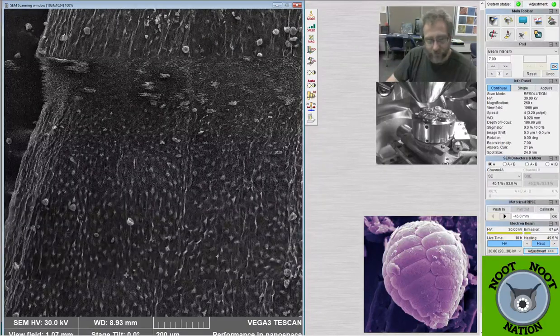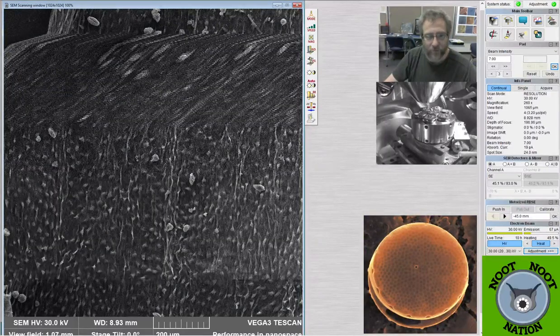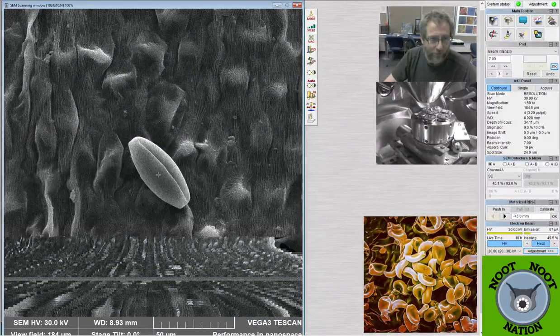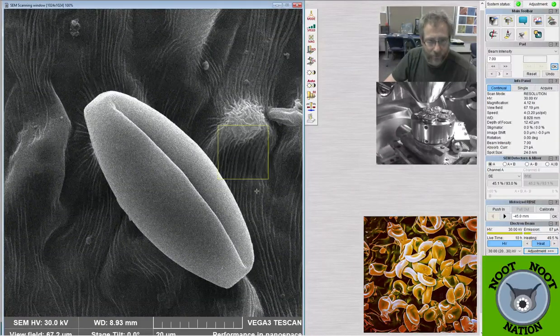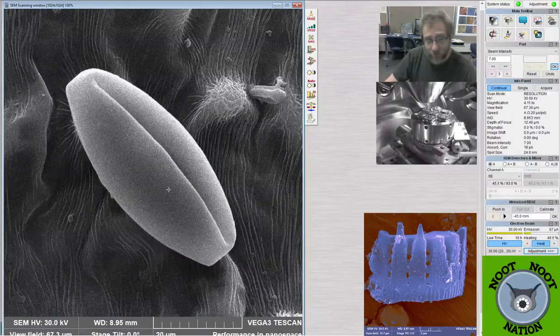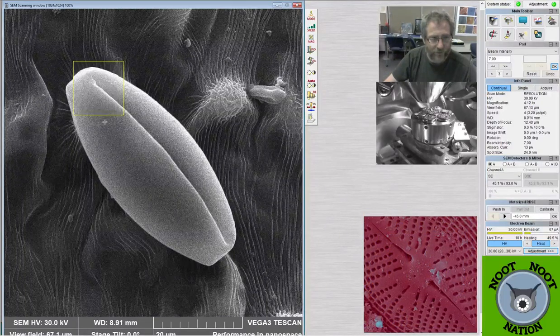There are sort of classes of microscopes that go from cheap and functional to the high-end stuff. But I would argue you don't need the high-end stuff. Very rarely would you need something like that for something your kids would enjoy or that you could use. A simple AmScope you can get from Amazon for a couple hundred bucks or less is going to be fine for anything you would use in your life. You'd probably be happy with it.